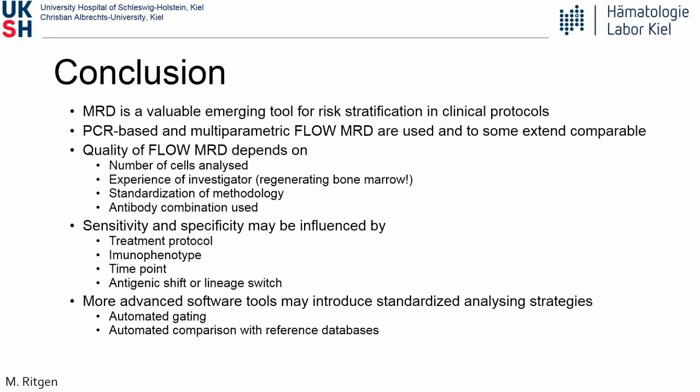And then you need a good overview of the normal B cell regeneration. So you need normal bone marrow samples, best under the normal treatment you would have your MRD samples of, to know what happens in the bone marrow with the normal B cells. Or you choose a published panel like the Euroflow panels, and I think within the next month there will be databases available for even MRD detection, which you can compare your sample to.